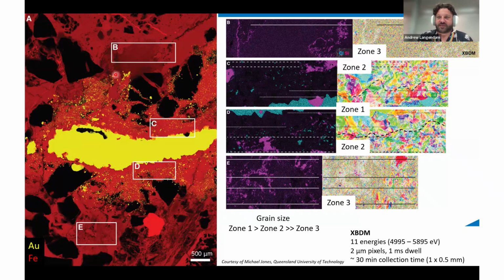So they built up these maps here, solved for the orientation, and then were able to take data from their XANES maps that essentially made it so they were looking at a pseudopowder. So they may not have been looking at, say, all the same orientation of crystal, so you want to average out the orientations to get the best data.